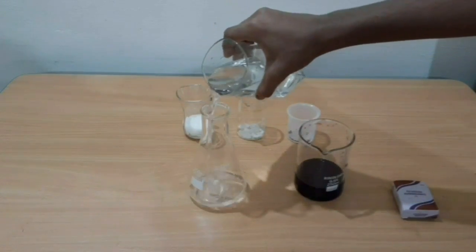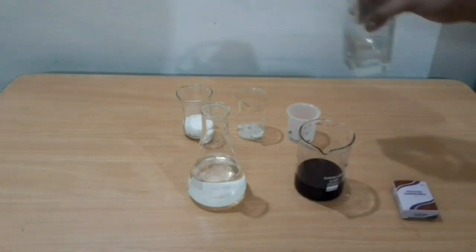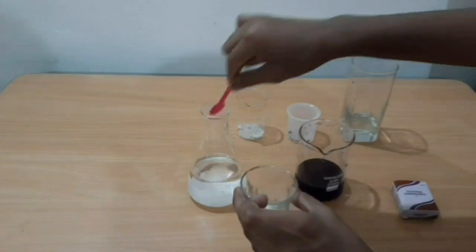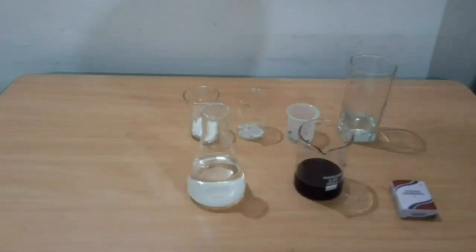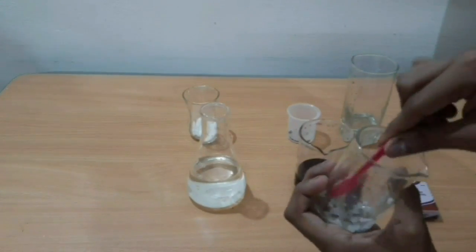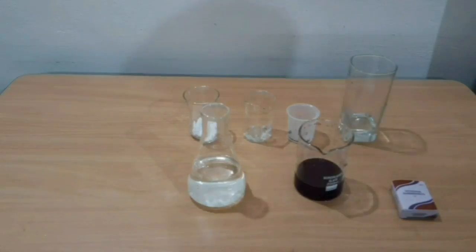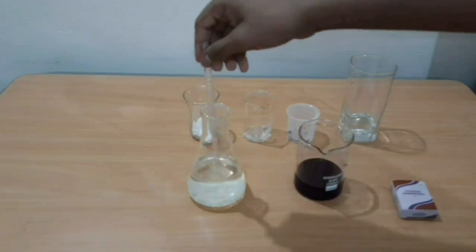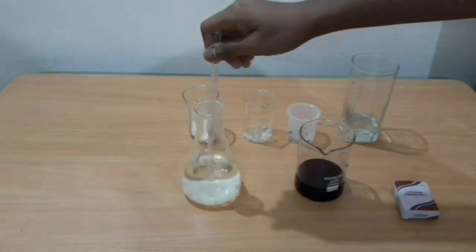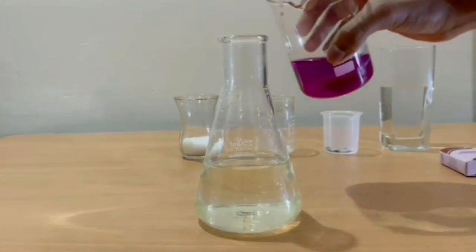Take 200 ml of water in a conical flask. Add sugar and sodium hydroxide into the water. Now stir the solution well. Now let us add 50 ml of potassium permanganate to the sugar and sodium hydroxide solution.